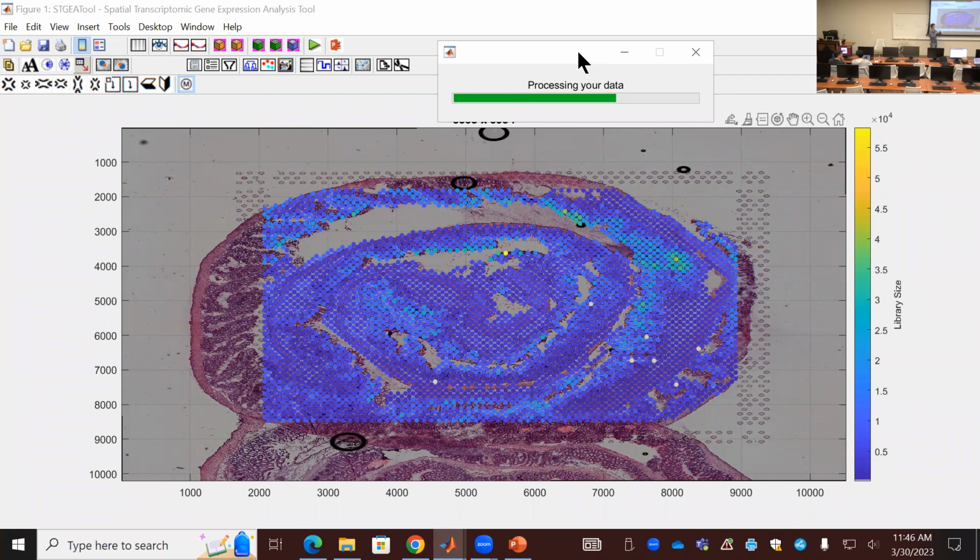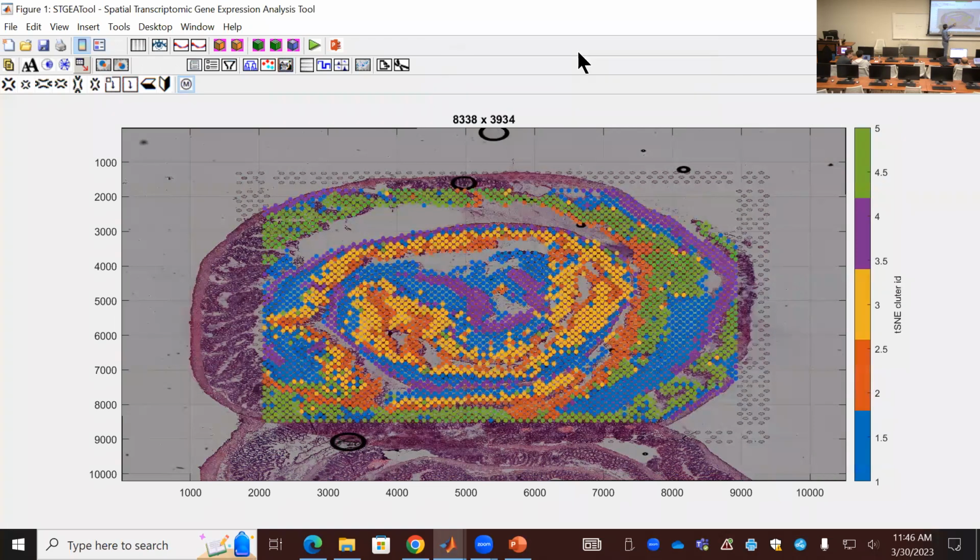So that will be a t-SNE, and you can imagine. And then to find those clusters, 5 different clusters, map back the cluster's ID with different colors in there. So you see some of these orange clusters on the circle structure. Okay.